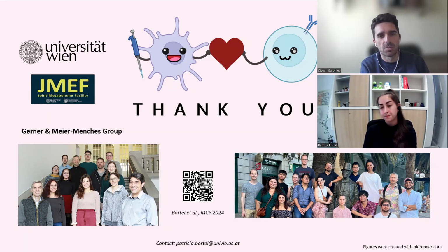Yeah, and I think there'll probably be some gains. Overall, once you start pooling the eluates, unless you want to analyze them in parallel, you start decreasing those gains. It's going to be a balance between mass spec time versus how much depth of coverage you would get. Something that we discussed offline the other day.